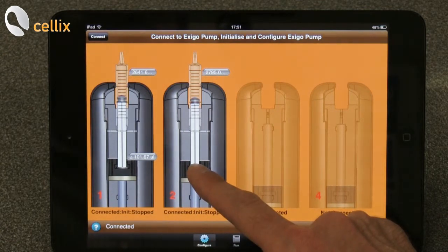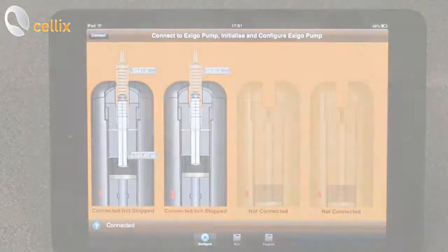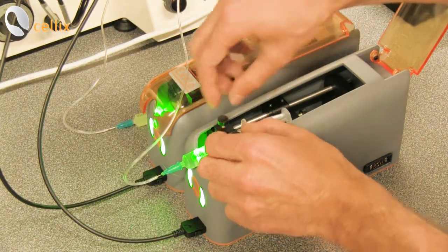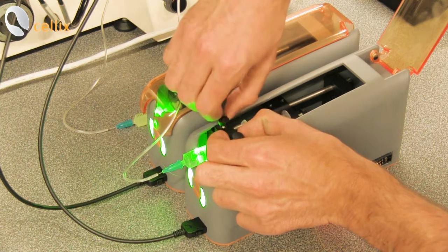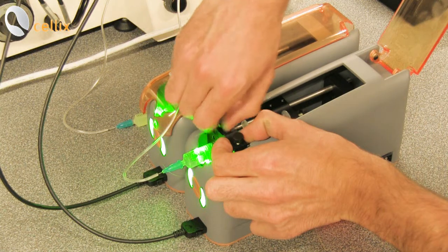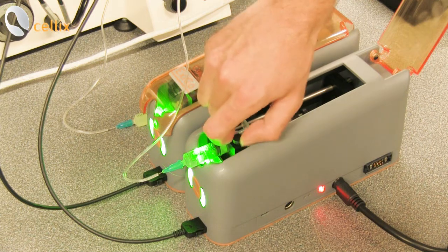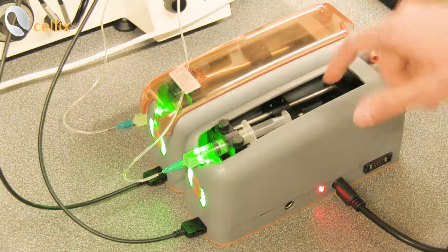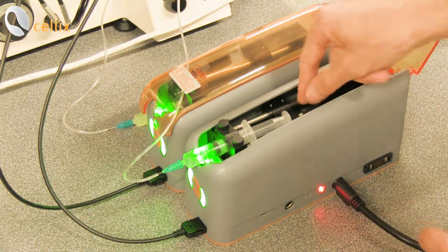The same can be done with the second pump. We can now clamp the syringe — as we can see, the guide is aligned with the plunger of the syringe. We tighten the screws of the clamp, and we also make sure that the screws which hold the plunger are tightened.